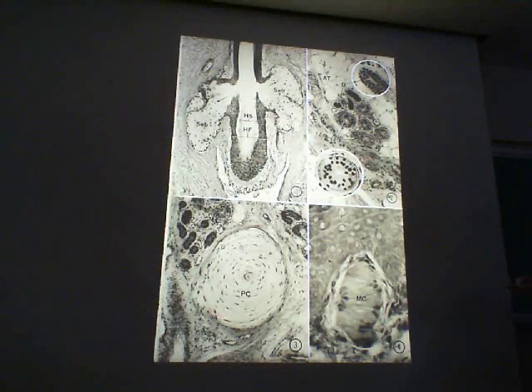Okay, what is this structure or organ? This is actually an organ as well. That is what? Pacinian corpuscle, and how about that right there? Okay, apocrine or eccrine sweat gland. There's the duct right there. What kind of tissue lines that duct? Looks like a stratified cuboidal.